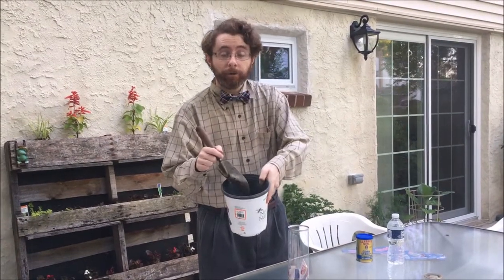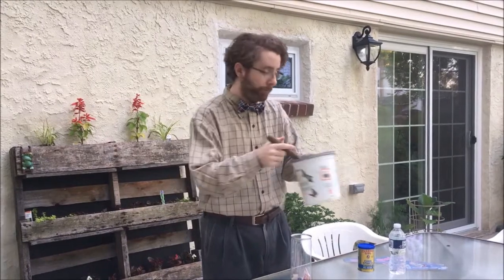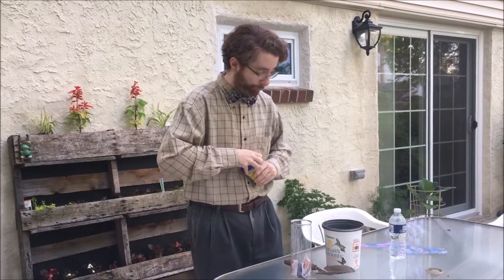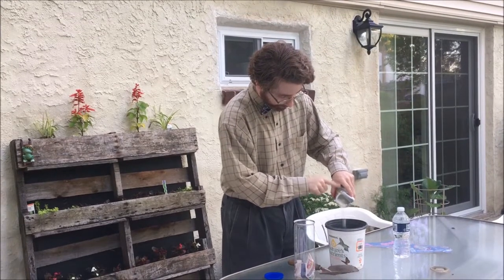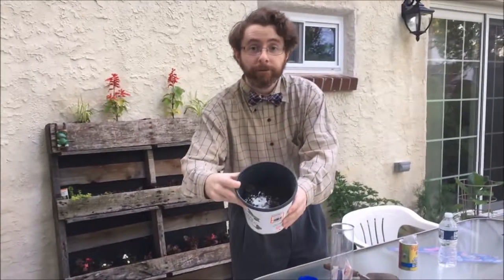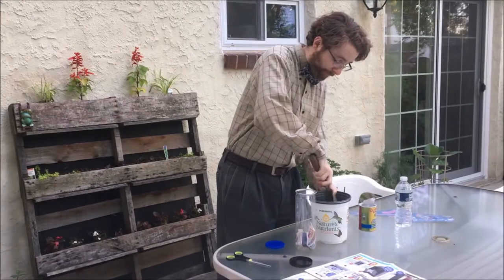I now take my soil sample — this is soil collected from my backyard. And we're going to add a little bit of cornstarch. Cornstarch contains carbon, which is also going to be food for the bacteria in our soil. I'm just going to sprinkle a little bit in. And now with my shovel, I'm going to give that a mix.